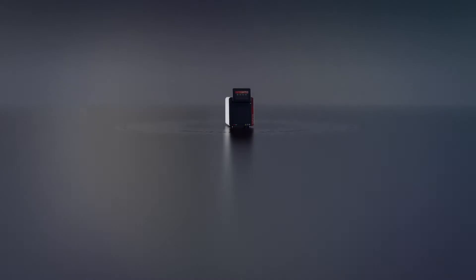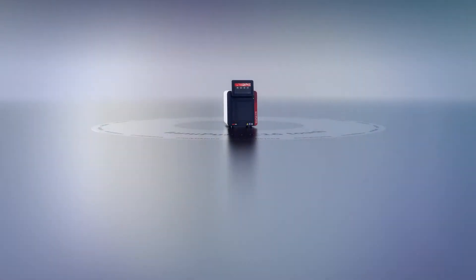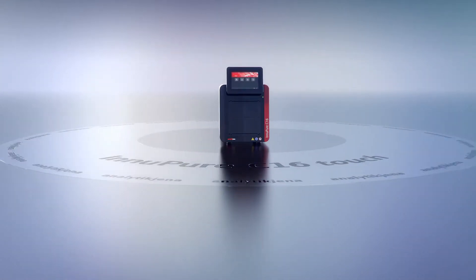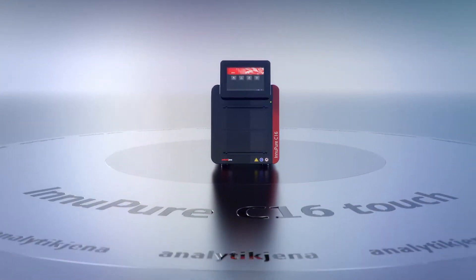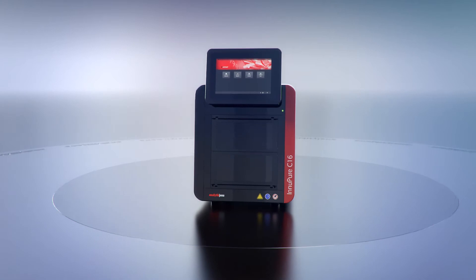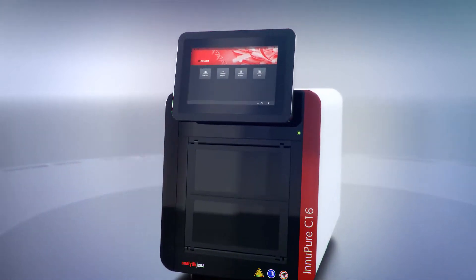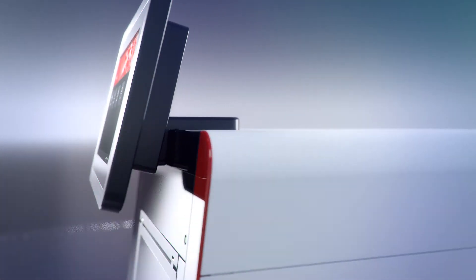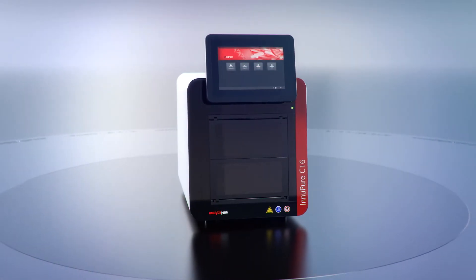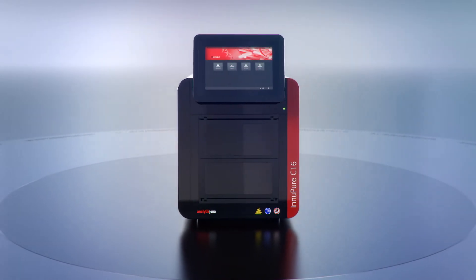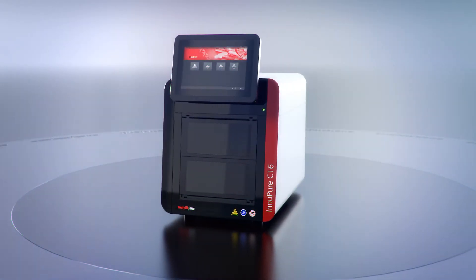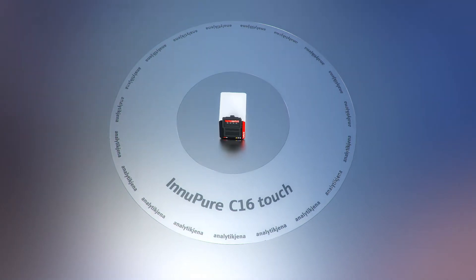Analytik Jena presents the InnuPure C16, a flexible, efficient extraction system for fully automating nucleic acid isolation and purification. The system offers a unique combination of features, uniting precise liquid handling steps with an extremely fast walk-away principle.